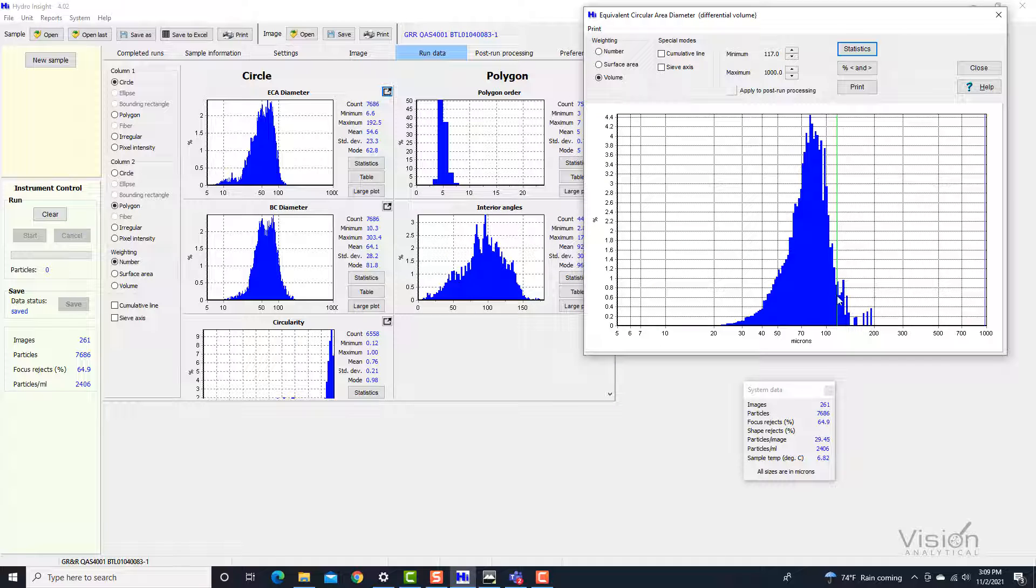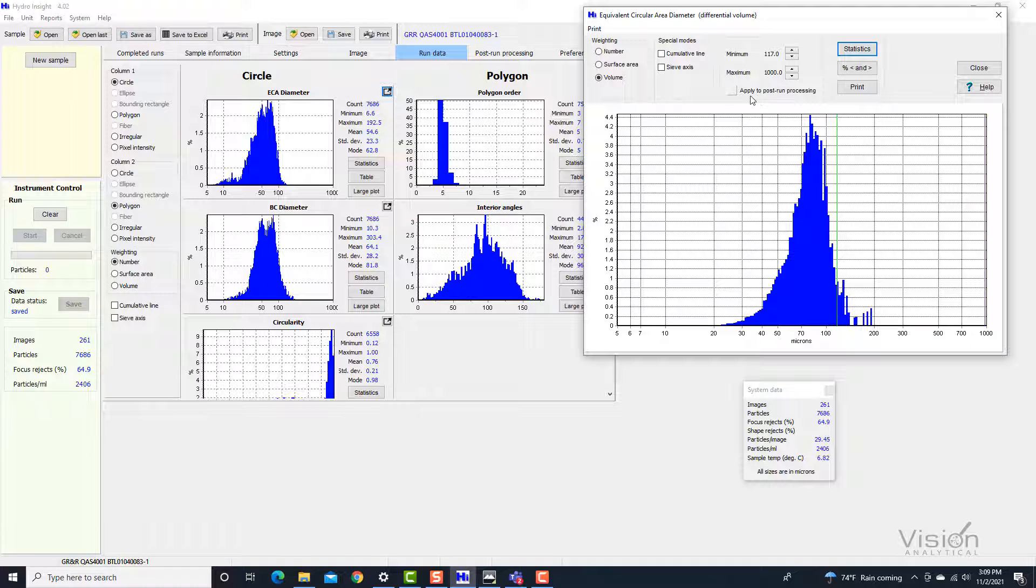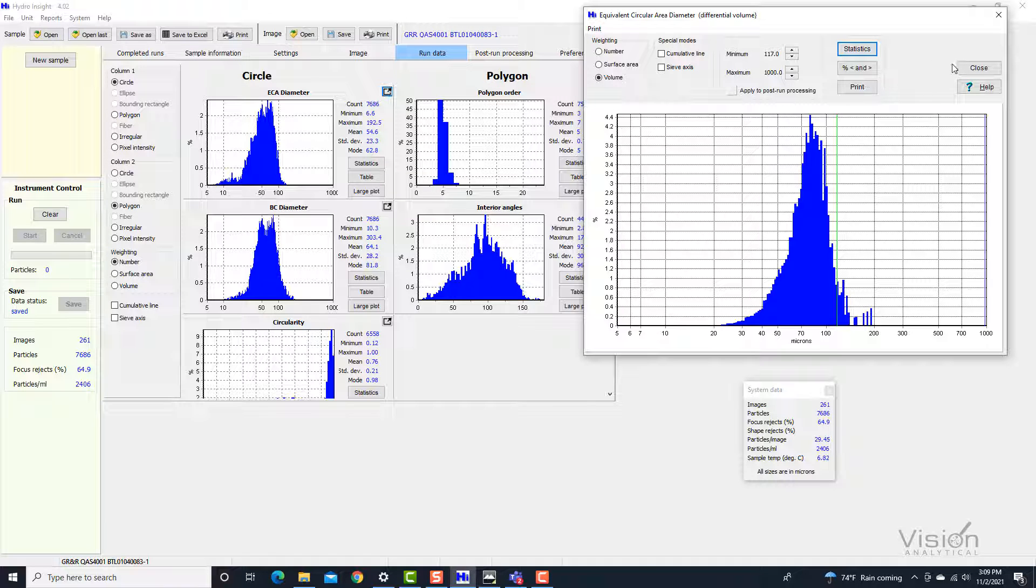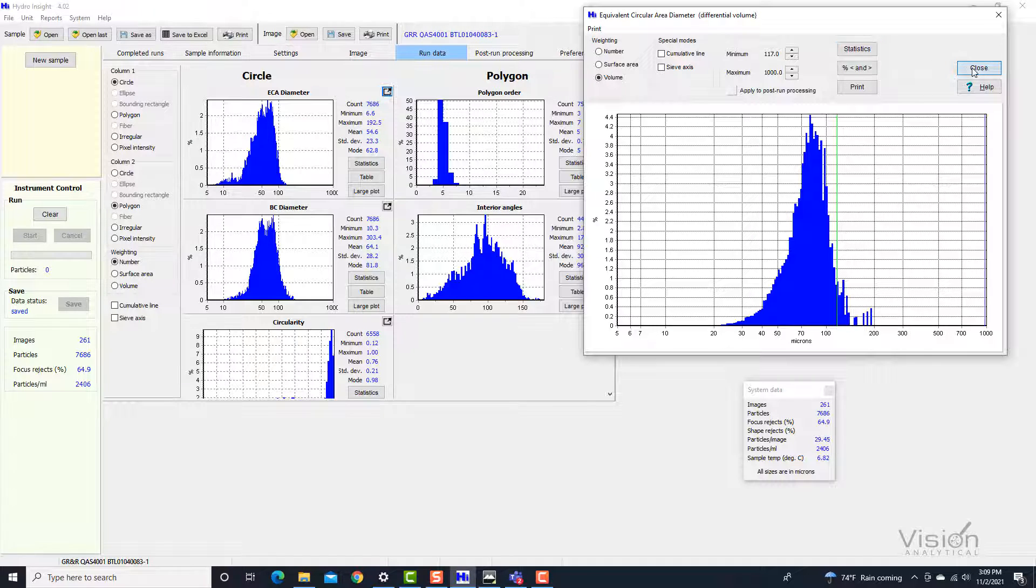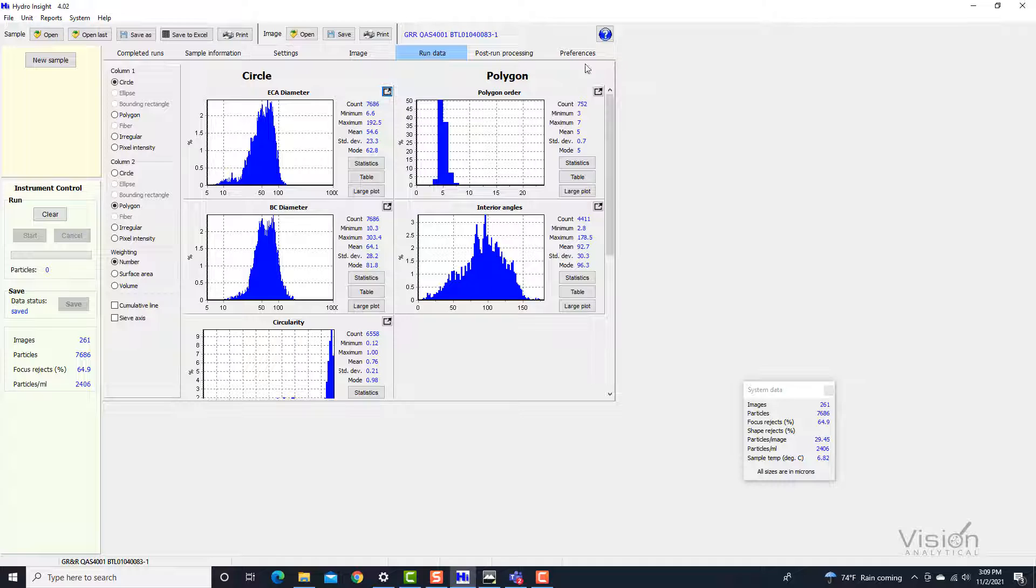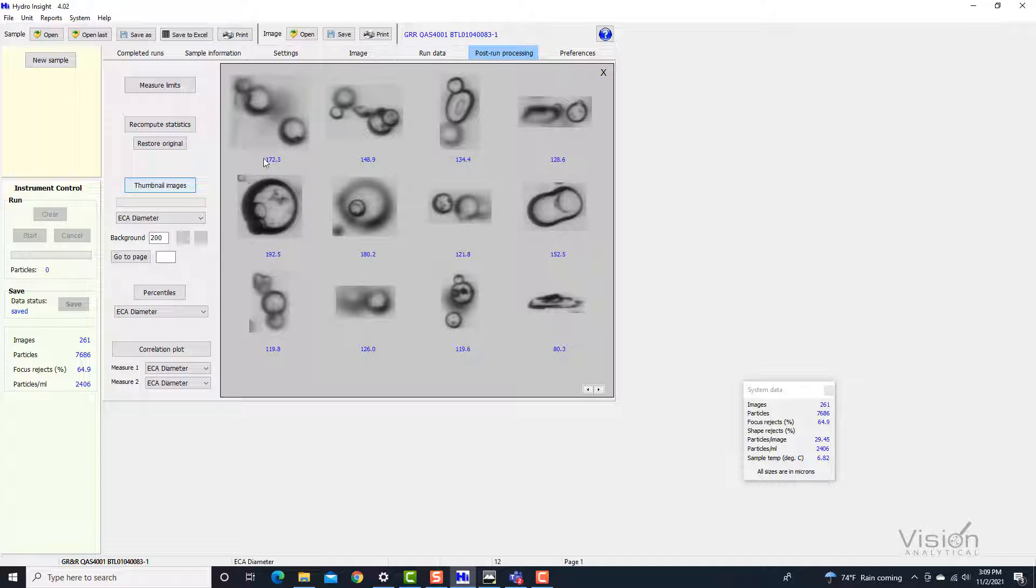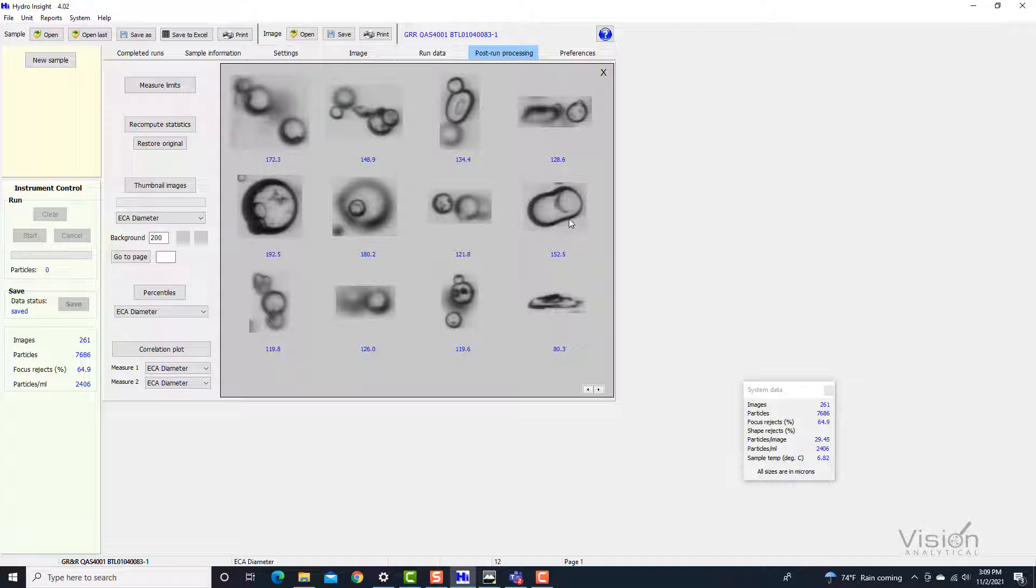But they were there. And if we actually want to see what those particles are, we can actually do that. We can close this and go to post-run processing and look at the actual thumbnails. We'll see that some of the larger particles that were captured, in some cases, were definitely there. That's a real particle. That's a real particle. About 152 microns.